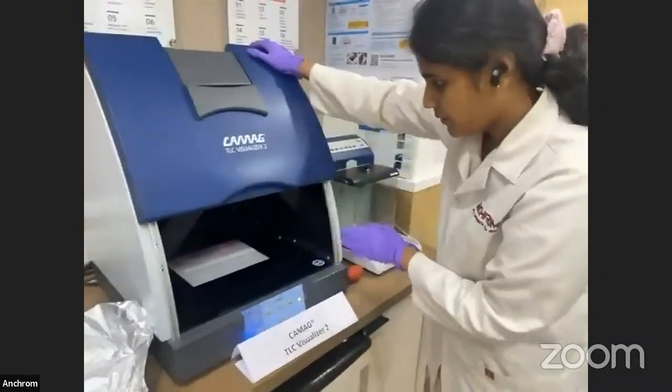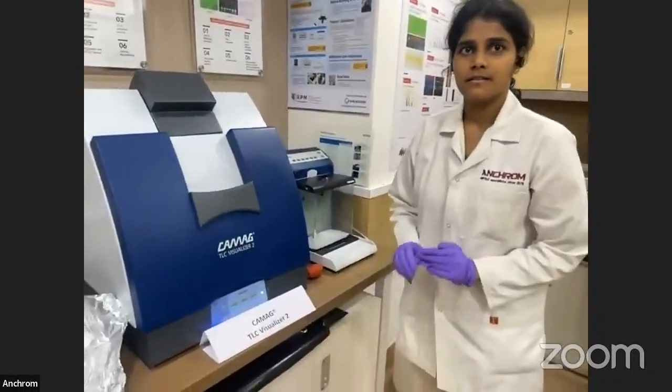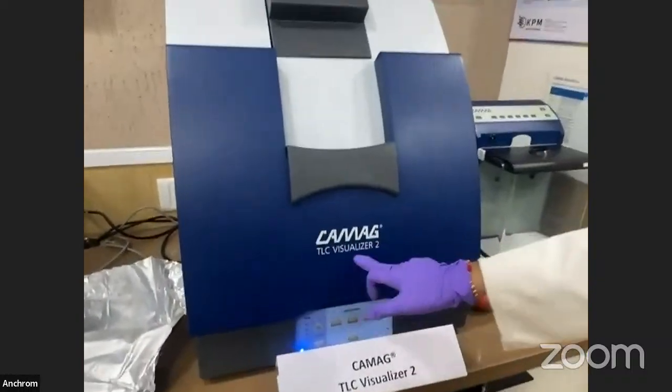So this is how the plate looks like. So now we'll go for capturing of the plate again in CAMAG Visualizer 2.